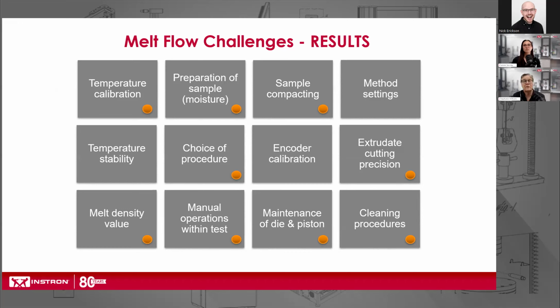If your specimens are hygroscopic, you need to account for a means to keep the water vapor in the air to a minimum. Cleanup, can't highlight enough. You need to make sure these systems, these melt flows, are clean between each test. Otherwise, you'll get inaccurate data.